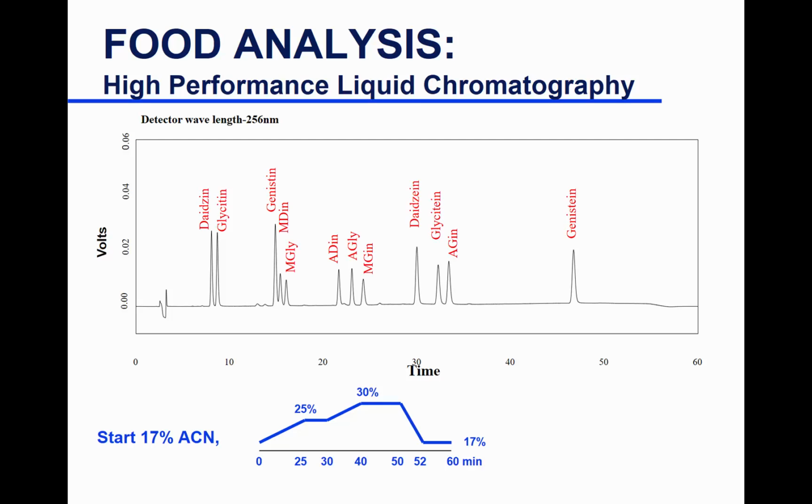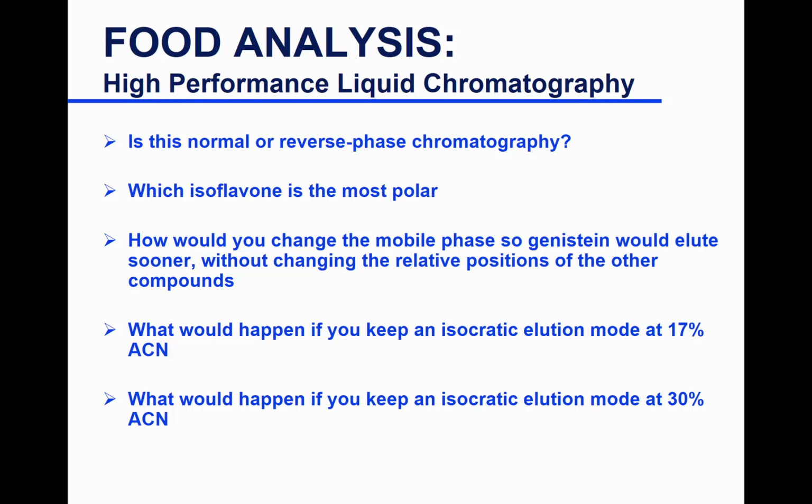Would increasing the flow rate also? Well, remember, yes, it will come sooner, but you will change the positions of the other ones as well. After everything else is already... Oh, after, okay, yeah. If the system allows you to change the flow rate, some systems allow you to have a gradient flow rate, some systems you cannot change the flow rate during a run. But yeah, that's another way of doing it.